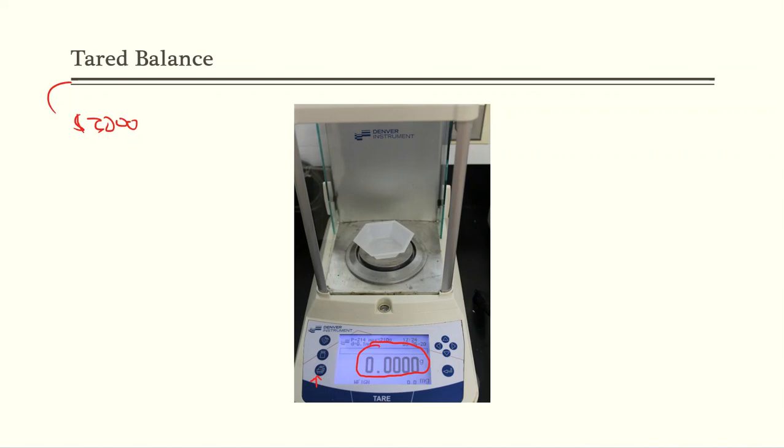So what I've done is that I've tared the balance. Here I've got a weigh boat up at the very top. This is what we call a weigh boat, and that weigh boat has nothing in it right now. It's just the weigh boat and it's completely empty. So I put the weigh boat on the balance, hit the tare button at the very bottom, and that made this balance read 0.0000 grams.